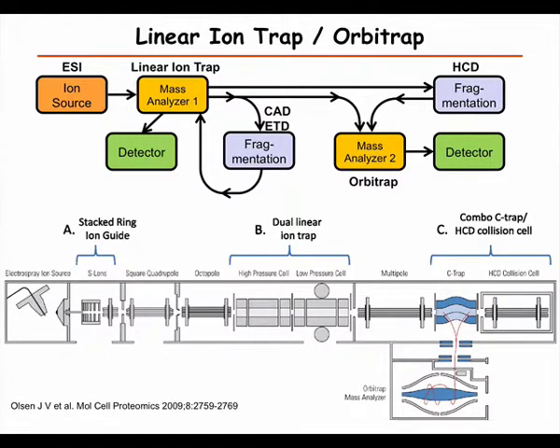And this is more schematic, a little bit closer to reality, how this looks. So here we have the electrospray source, and in this case, as you see, the needle is at an angle. And there has been a lot of debate. So the idea is that all the neutral molecules will go off here and not straight in and make the mass spectrometer dirty. But it varies how people do this also.